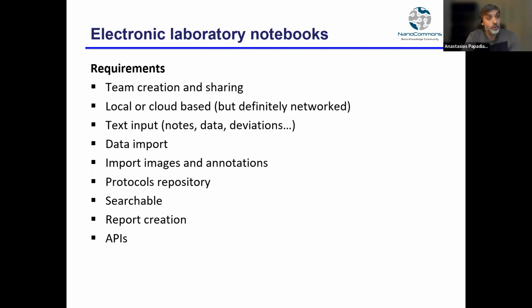And of course, you are able to readily search, using a search function, everything that you have done in there, so that you don't need, after a year or two of doing a project, to go through different paper notebooks or different disparate Excel files or whatever.